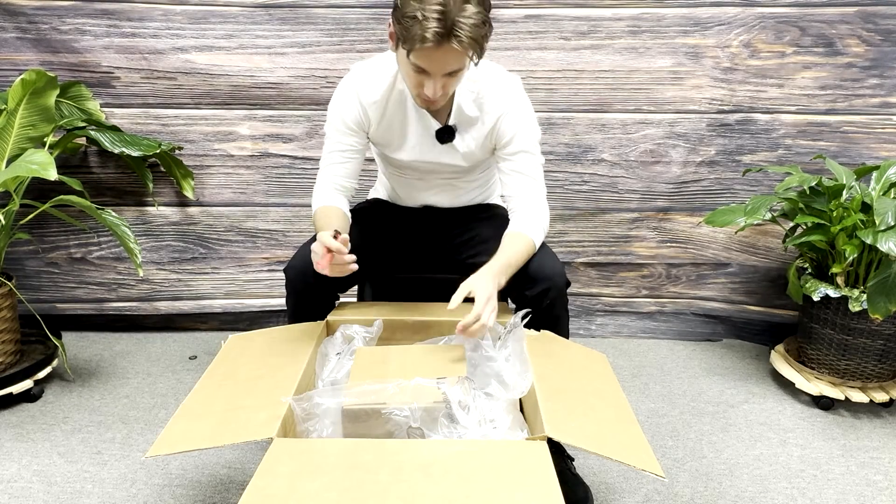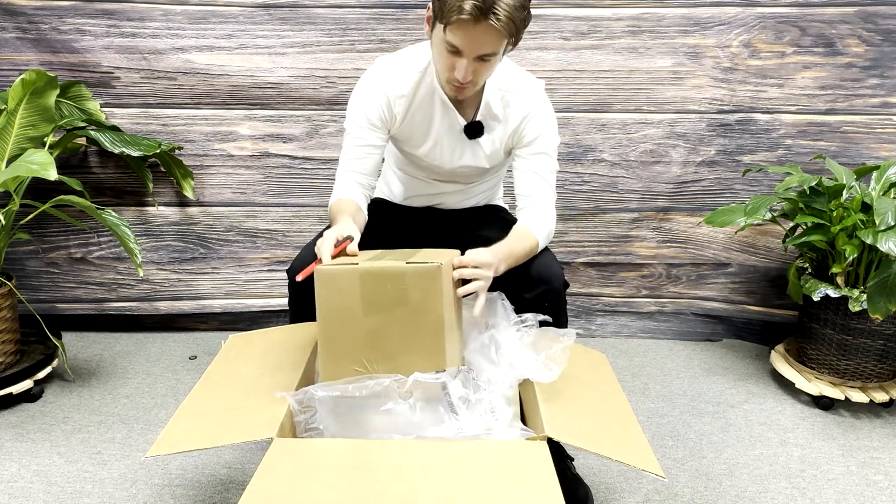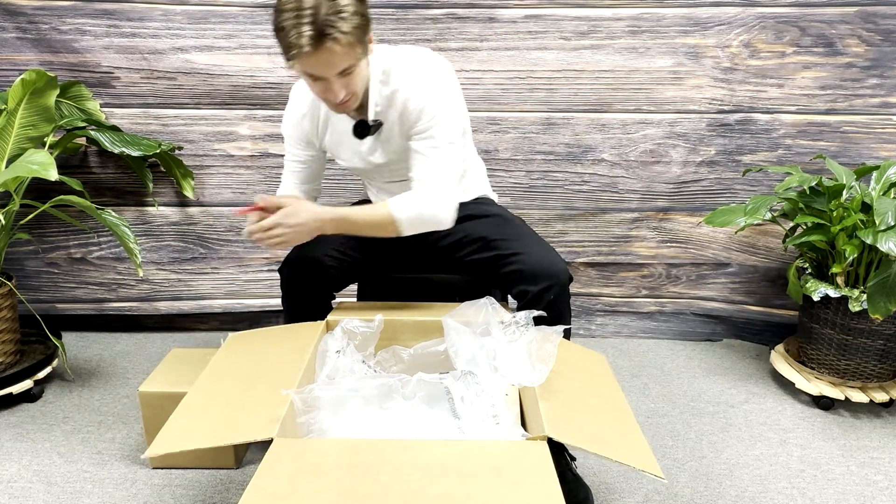This is your HEPA flow 12 by Bonsai. This is what it's going to look like when you open up your box. This is going to be your motor, go ahead and take that out, and then right below that is going to be your instructional pamphlet on how to assemble your Bonsai HEPA flow 12.